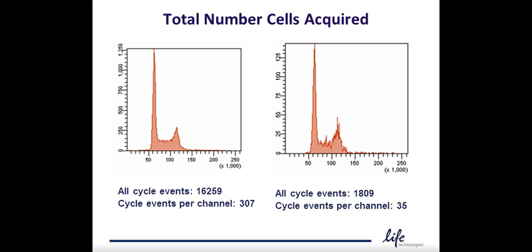A minimum of 10,000 events in the DNA content cell cycle analysis has been recommended by the DNA Cytometry Consensus Conference Guidelines, although detection of DNA aneuploid populations may be possible from histograms with fewer events. Accurate S-phase analysis may require more than this if the proportion of aneuploid cells is low or if the debris is high, and the total number of cells should increase.